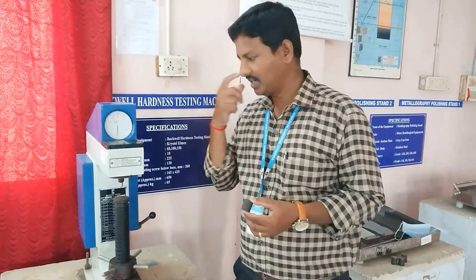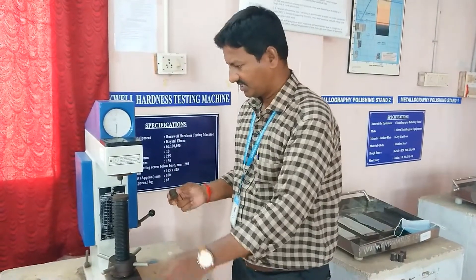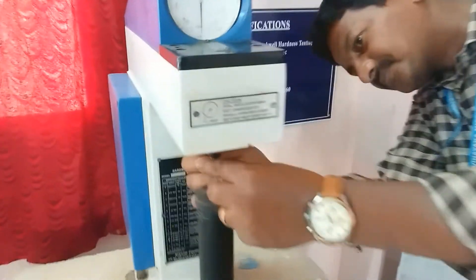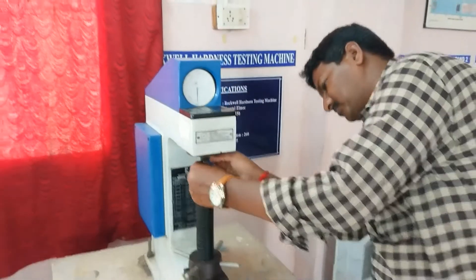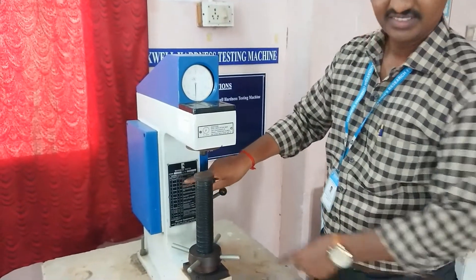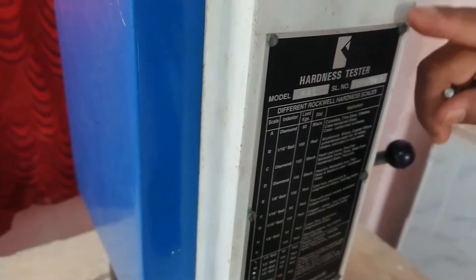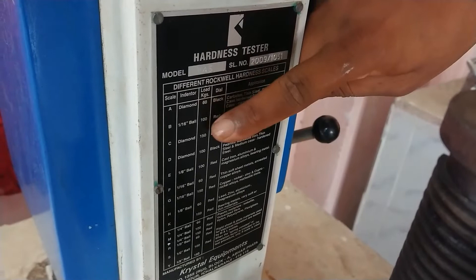This is the Rockwell hardness testing machine. You have to find the hardness number. This is called the indenter. Depending upon the material you are using, you can use either a ball indenter or a diamond indenter, and select the scale accordingly. For a ball or diamond indenter, you can choose based on the material.